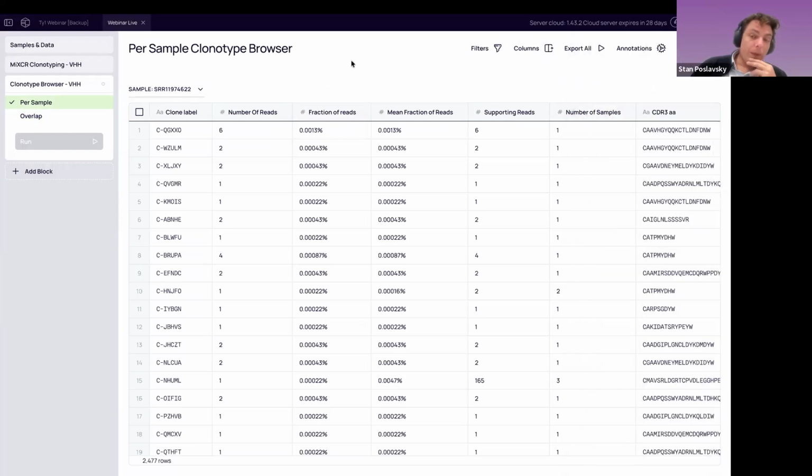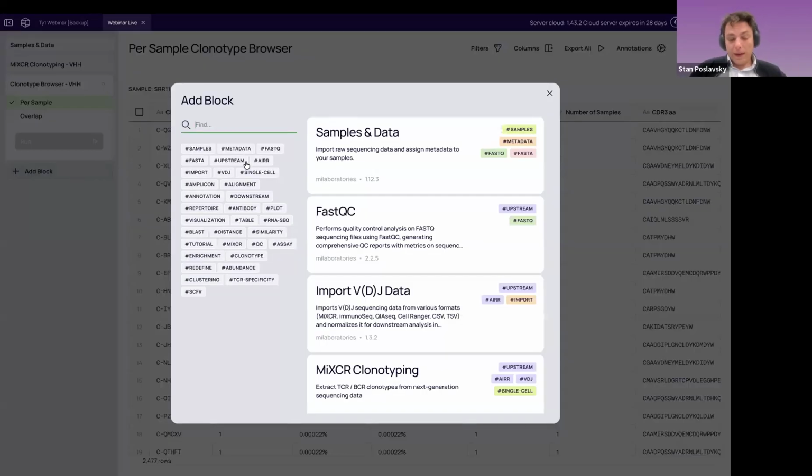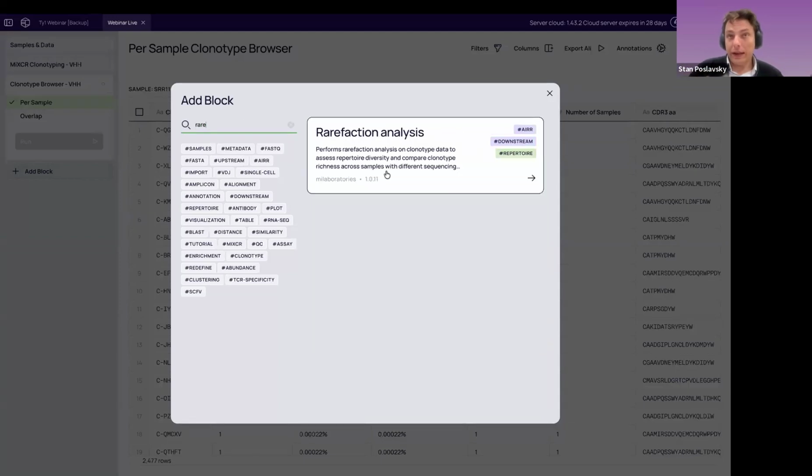Before doing the down selection, the standard step is to characterize our repertoire and see what we have, whether we have in general working phage and the funneling, the phage selection. Two components here. The first one, we need to understand whether the quality of the screening library is good enough. What I mean by this is that the aim of the screening library is to make it as diverse as possible, to have as many screening candidates as possible before we start phage display.